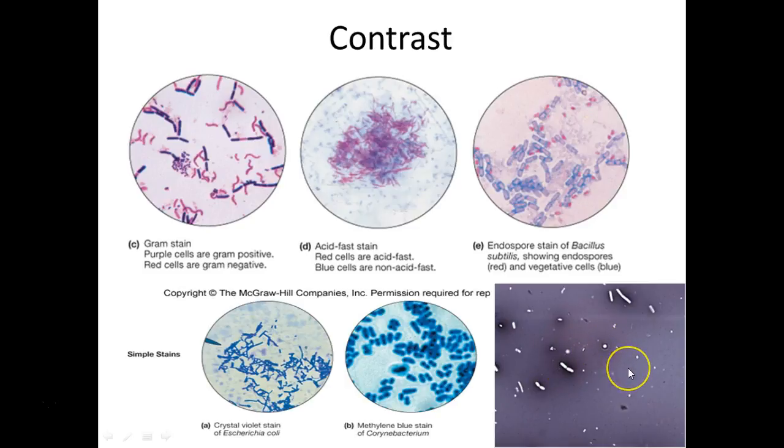The problem with this one, especially for beginning students, you guys see all these other little specks? That's just crud on the slide, like dirt, dust, pollen. This is the bacteria, these two little guys. And over here, here, those consistent rod shapes.